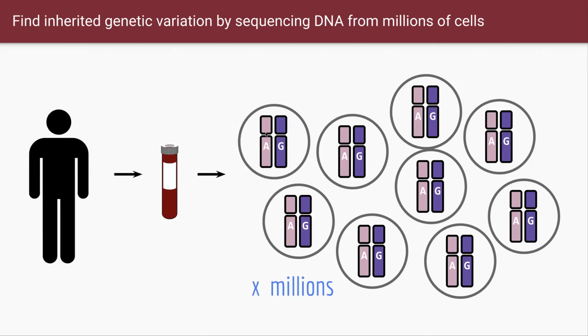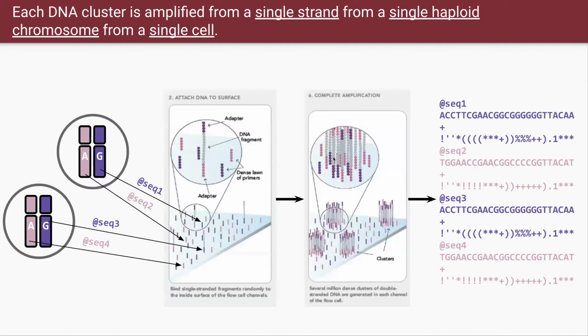So how is this related to your information? Once you get the DNA extracted from someone, that person has the sequence from mother and father, like in here. Then if you put it into a sequencing machine, that information is changed to text information like in here. This looks like crazy characters, but this is the thing you're going to use in genomic analysis. And that information is not just a few lines, it's going to be like 100 million lines in your data, right? And this is just for one person. This is the crazy thing.